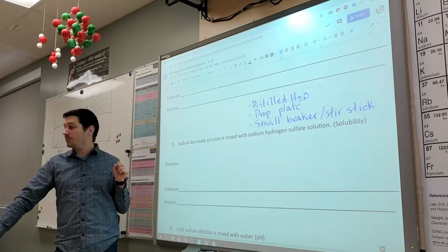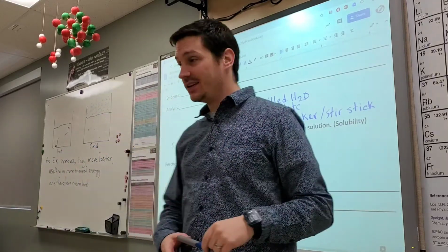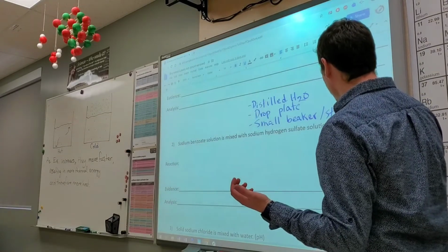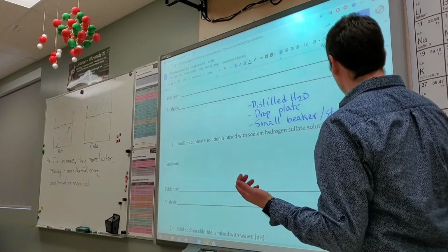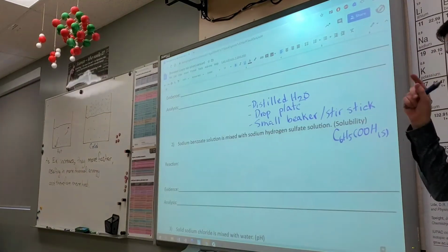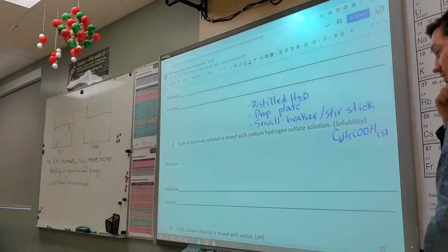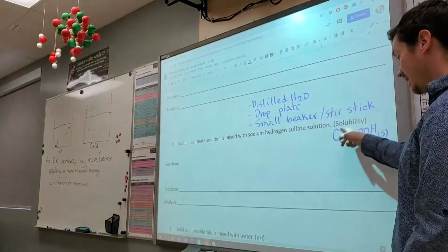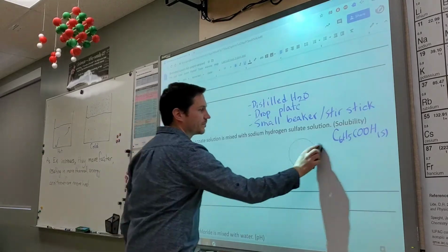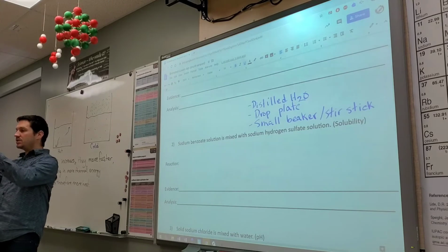You should see something that is insoluble. Now, I'll give you a hint, okay? Benzoic acid, C6H5COOH, should be a solid in water. Benzoic acid has very low solubility in water. So this thing should have low solubility. So if you predicted that this thing would be made, then you should also predict that there would be a precipitate, okay? Again, you're just going to do station number 2, right? You're adding 2 liquids, so you just need a spot plate, that's all.